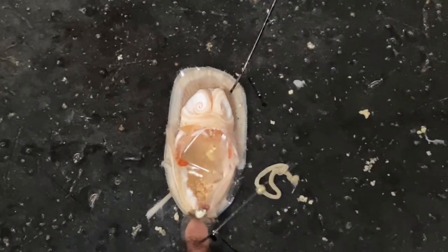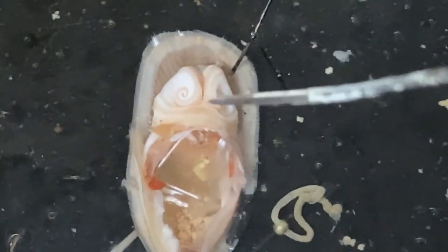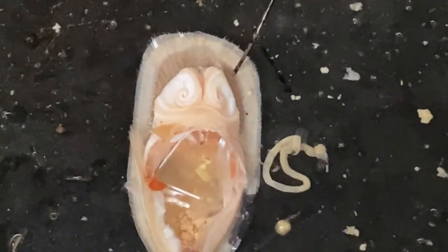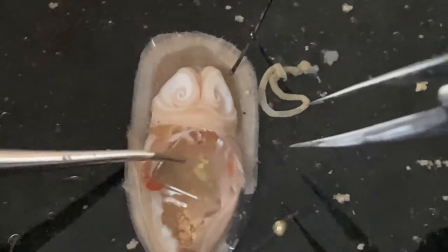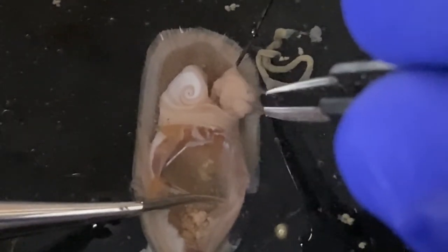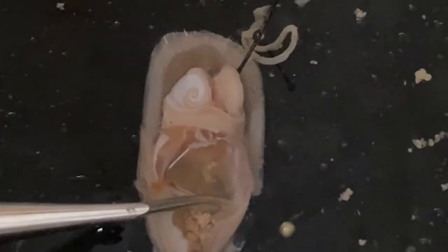Now, one thing that I want to show you while I have this in this orientation is a little bit more about the lophophores. So if we come in here and pull these lophophores apart and kind of flip them over, what you'll be able to see is the coiled structure of the lophophore and the many tentacles that are on the other surface. That frilly set of extensions coming off of that inside, or what would be actually its dorsal surface, are the tentacles of the lophophore.